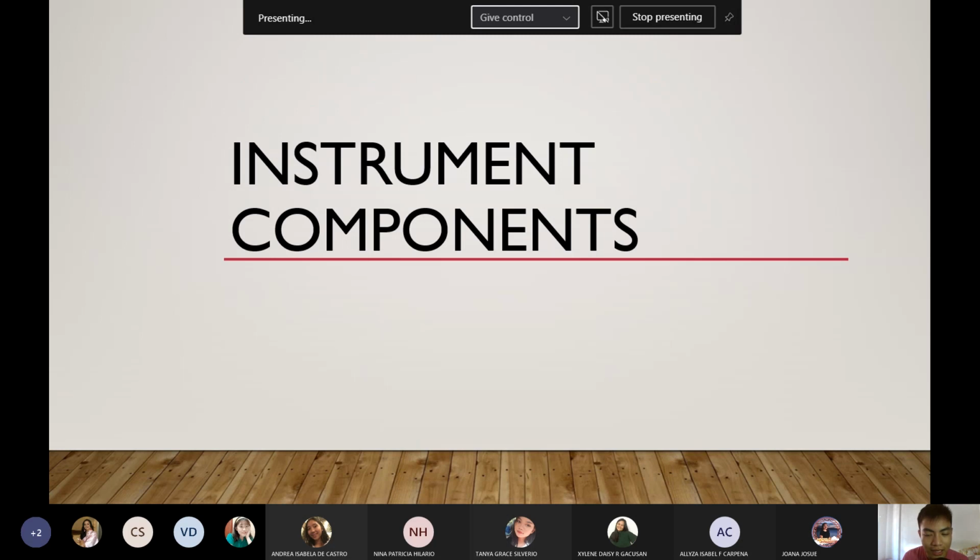So now we have covered the four types of spectro analysis. Let's proceed with the components. Basically, we will only talk about parts. These components have some similarities. We will not discuss this in-depth, because if we discuss this in-depth, you might get a perfect score in the chemistry board exam. The questions in our board exam are like this, and they are actually quite difficult. But we will just go through them and look at the similarities and the differences. That is all we will do for now.